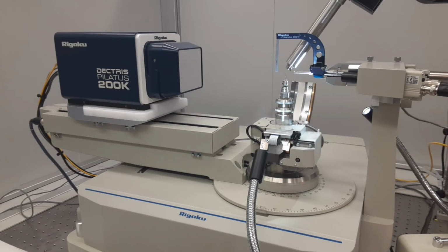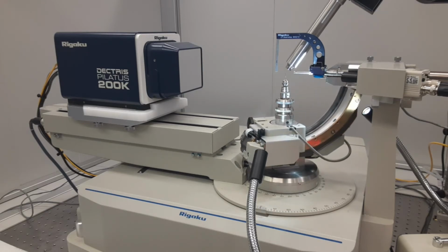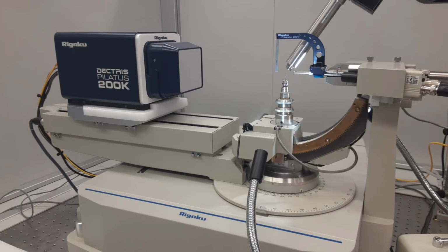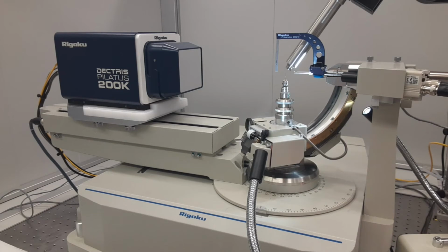So the first direction that it can rotate is omega, and I'll move omega now, and that is the axis of rotation, but the crystal gets rotated as you collect your data set. So typically omega will move and will hold the other axes constant. So that's omega. Another direction it can move is the 2 theta angle.